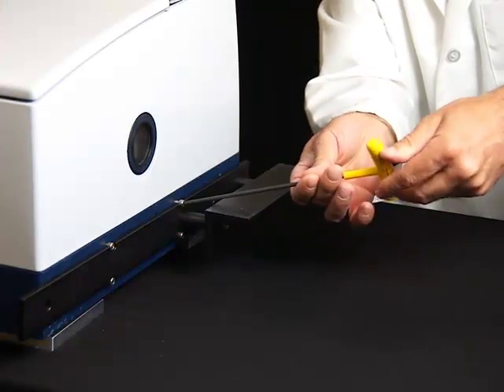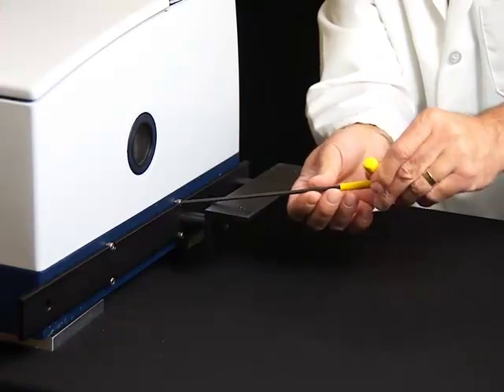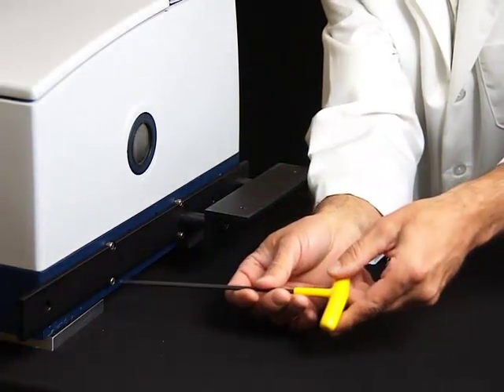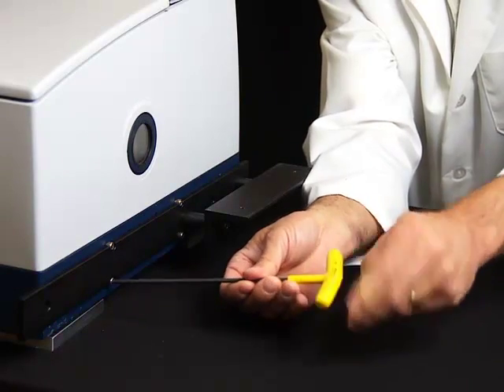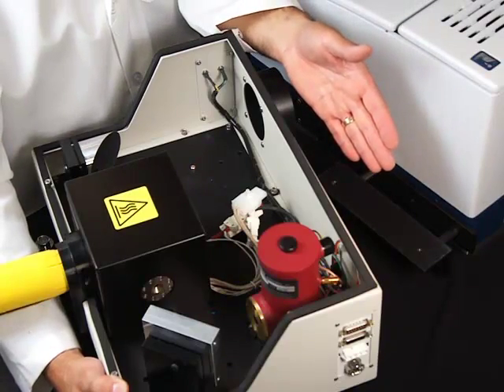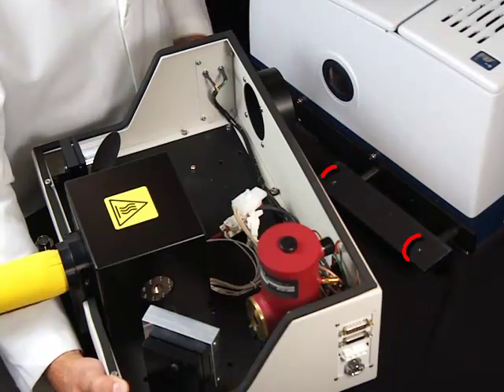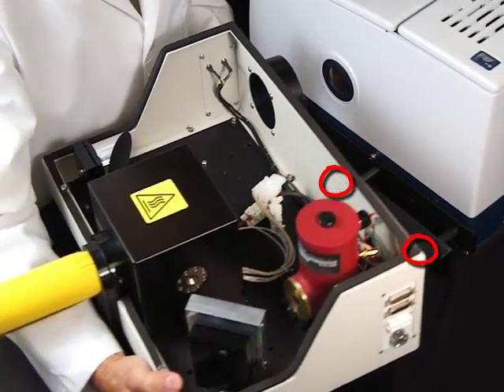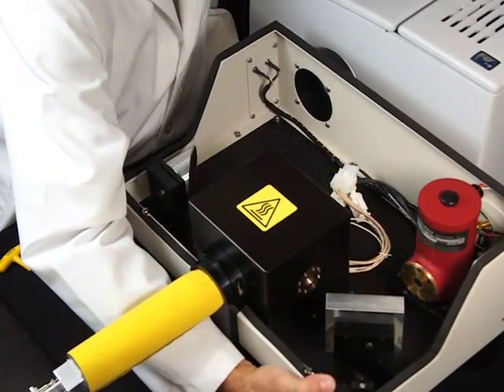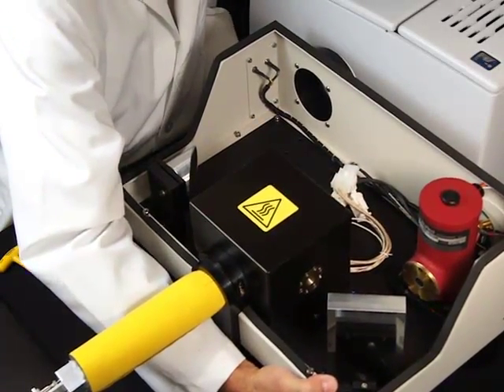Tighten the screws so the bracket is firmly attached to the spectrometer base. Slide the GC-IR interface on top of the mating surface of the bracket and align with the two mounting holes. Adjust the position of the accessory box so it sits squarely against the instrument.